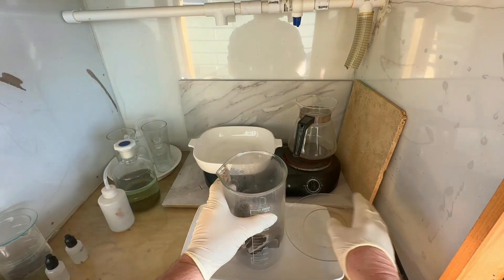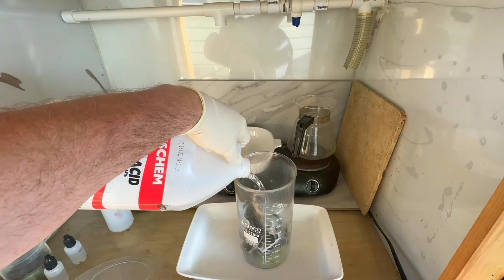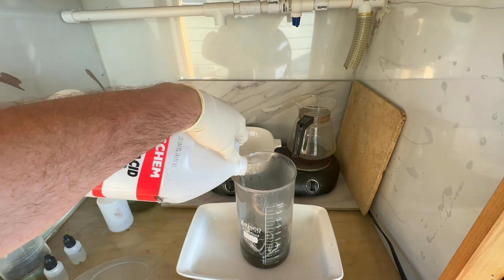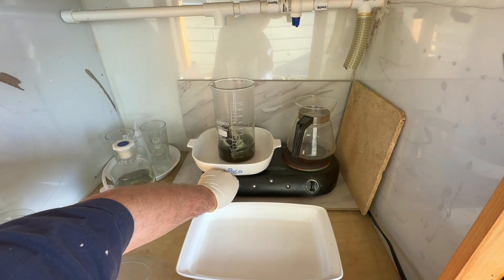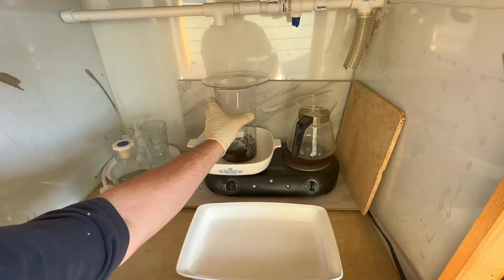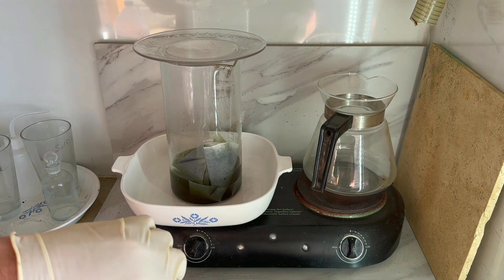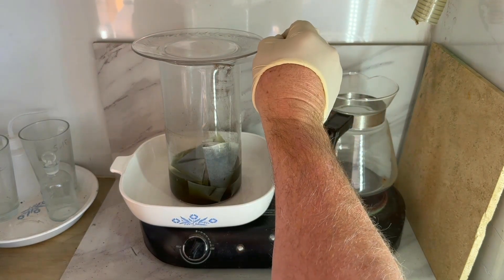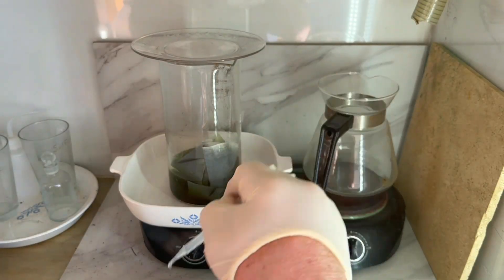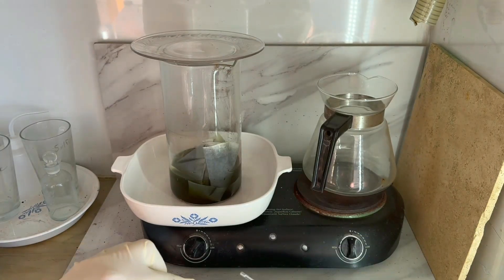Everything's filtered — ended up with three pretty full filter papers. We're going to add some hydrochloric acid, put this up on the heat, get it covered, add our nitric acid, and dissolve the sediment in there — probably some gold and some base metals. The aqua regia will also eat up the filters themselves so we can filter those out. We'll probably start with about eight or ten milliliters of nitric acid and let the aqua regia do its thing.